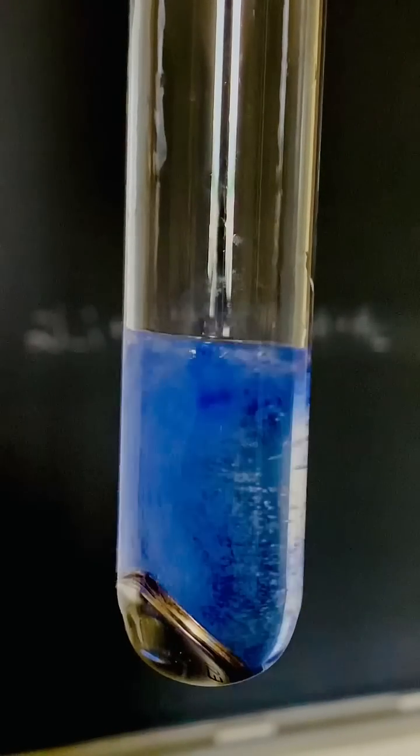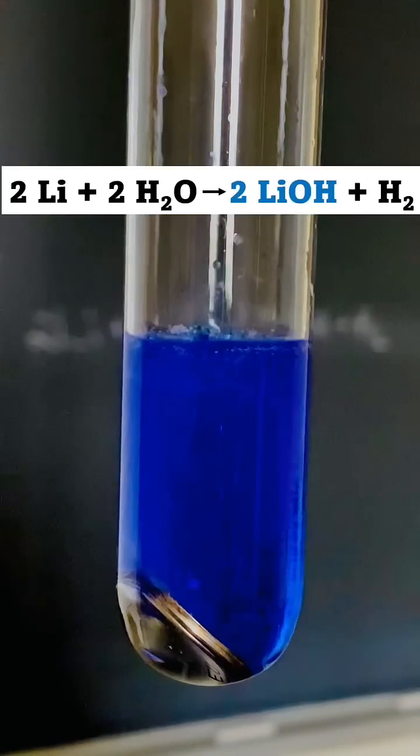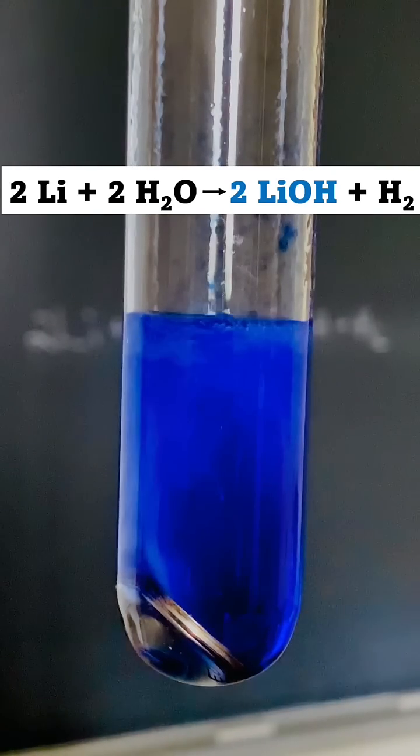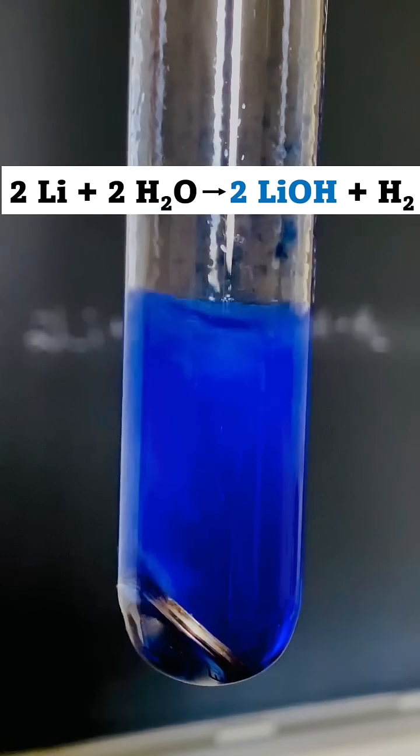That turned blue really fast. The blue color tells me that base is being formed in this reaction. It's known that lithium forms base when it reacts with water, so we've got some evidence that this battery contains lithium.